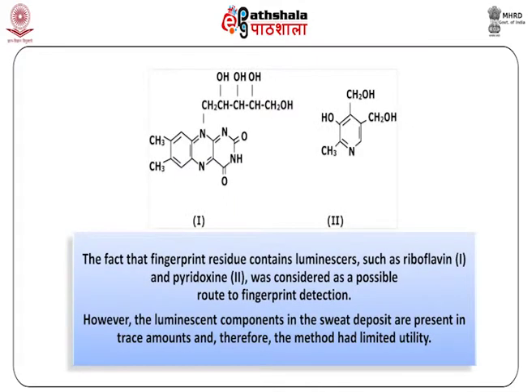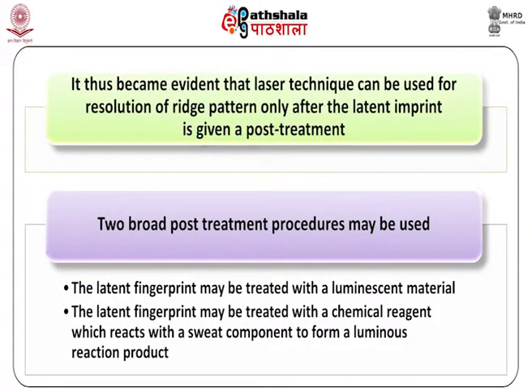The fact that fingerprint residue contains luminescers such as riboflavin and pyridoxine was considered as a possible route to fingerprint detection. However, the luminescent components in the sweat deposit are present in trace amounts and therefore the method had limited utility. It thus became evident that laser technique can be used for resolution of ridge pattern only after the latent imprint is given a post-treatment.